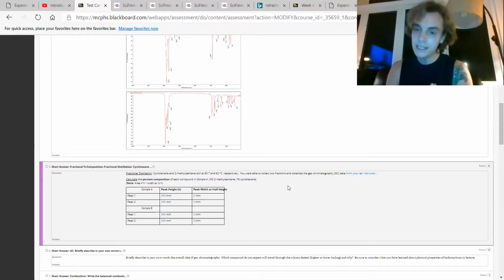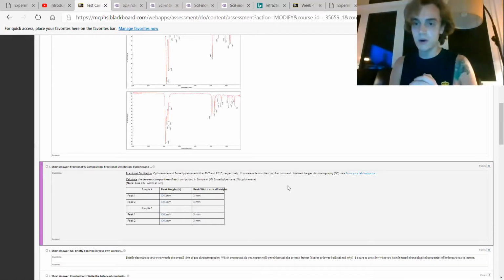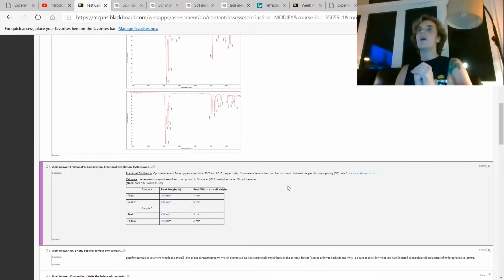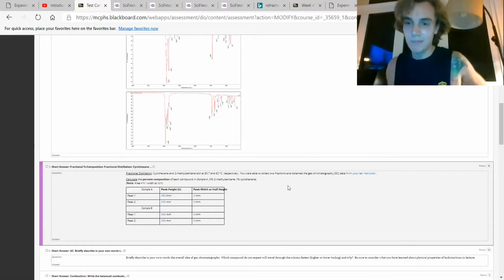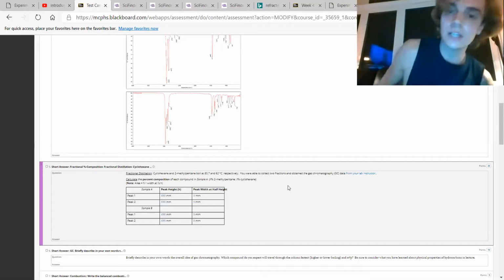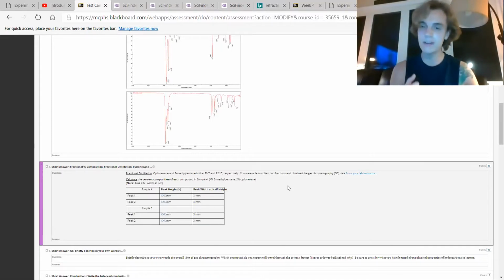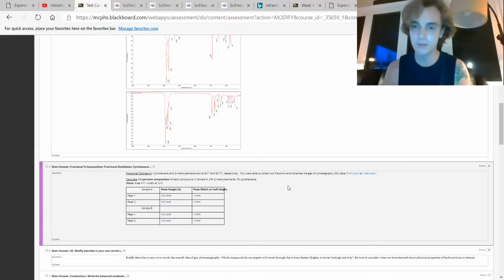But the point of refractometry, which I would like to elicit for a previous question and also help you with this one, is that every single compound, especially the ones you'll see in this lab, let's just include liquid compounds. And when I say liquid compounds, I mean liquid at standard temperature and pressure, meaning at any earthly regular standard temperature and pressure, they are liquid.